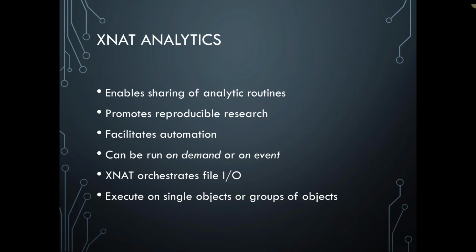And because imaging workflows have tended to be complicated and vary a lot with different versions of underlying software, knowing how to reproduce someone's image processing results can be difficult. And I think being able to share containers will really make that a lot easier, because the complexities of the exact libraries and versions of software tend to go away.